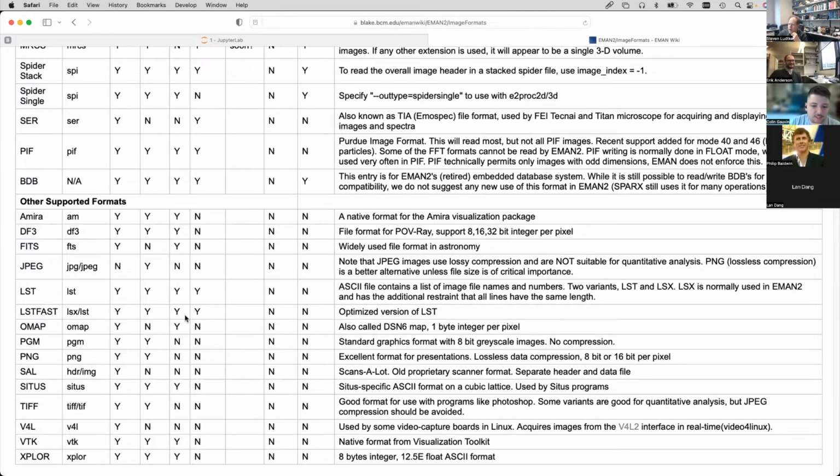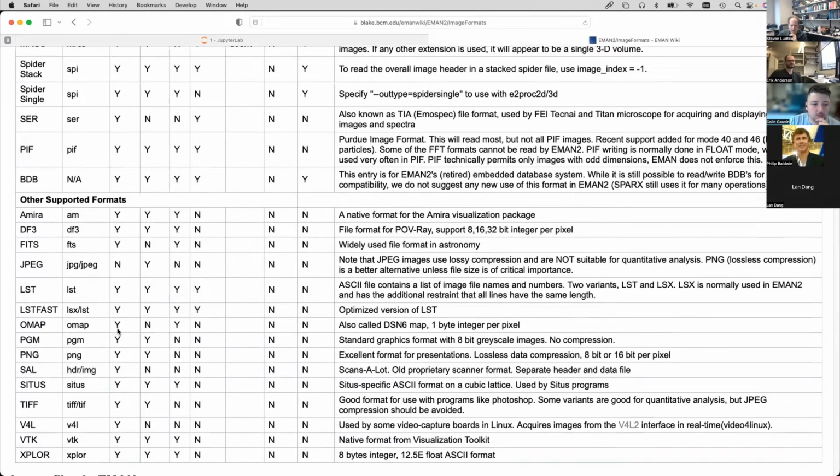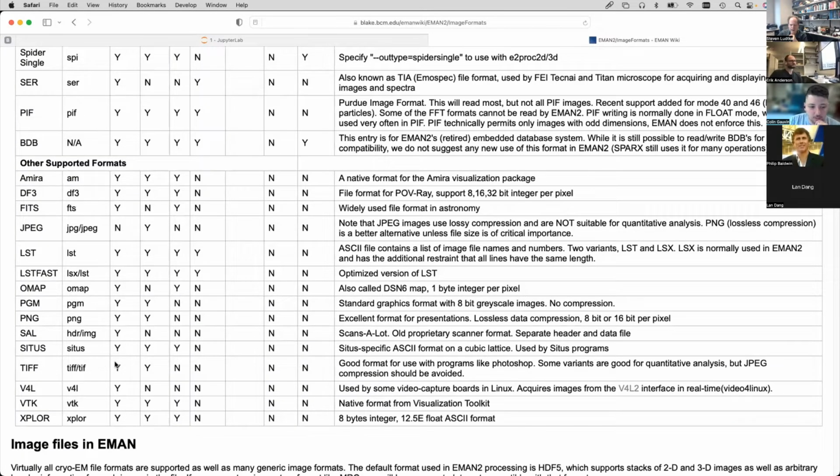Okay. Yeah, that's also the only way to write movies from Serial EM with compression right now. Yeah, no, I realize that. It's a standard format. I could have sworn we added support for reading TIFF stacks. I thought we just hadn't added support yet for writing to TIFF stacks. I mean, TIFF is actually tried, so I'll try it. Have you tried? You haven't tried it. No, I just looked on the table.